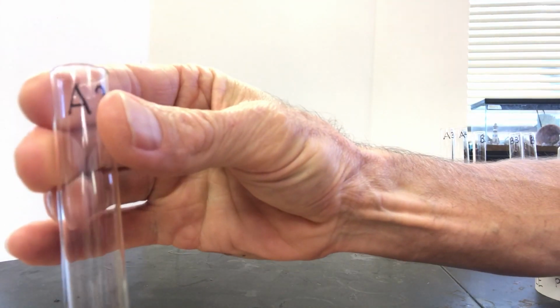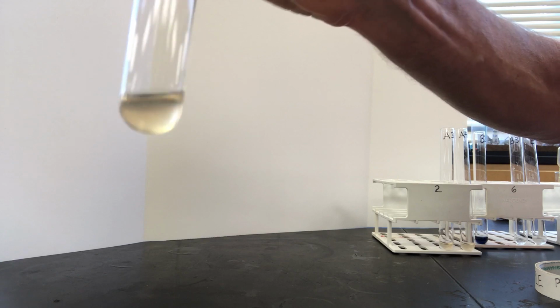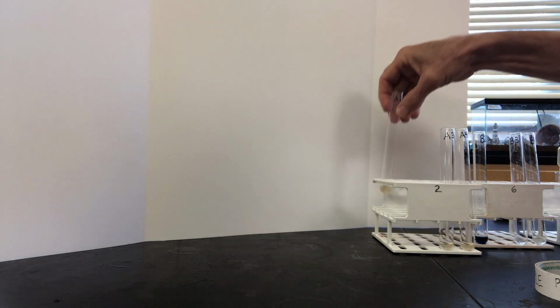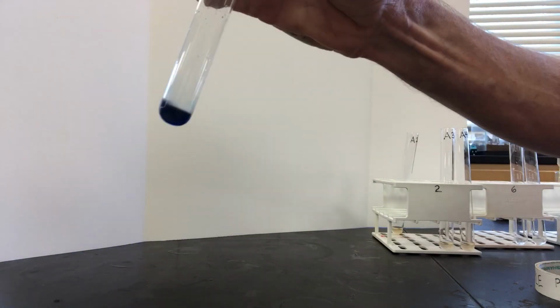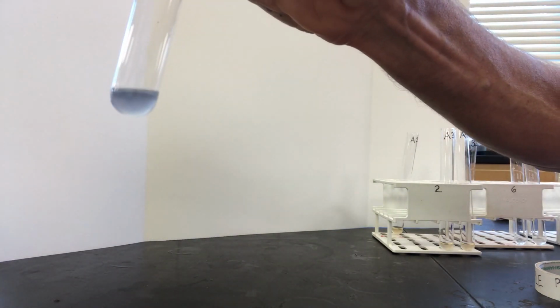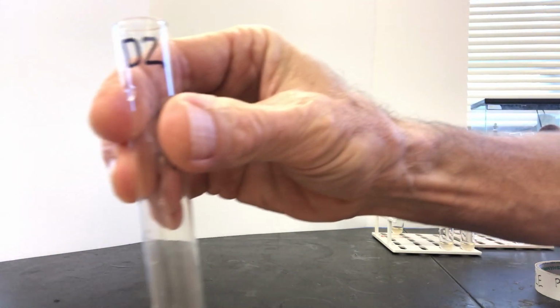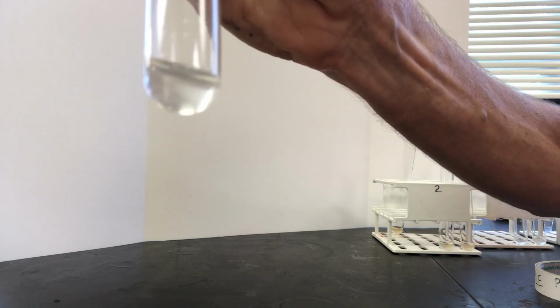The iodine test gave the following results. A2, apple. B2, potato chips. C2, refried beans. And D2, pepperoni. You're looking for a dark blue-black or blue-gray color.